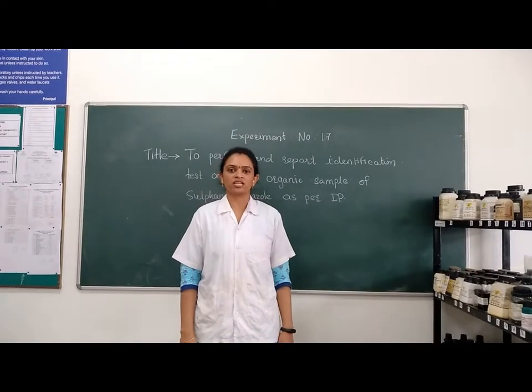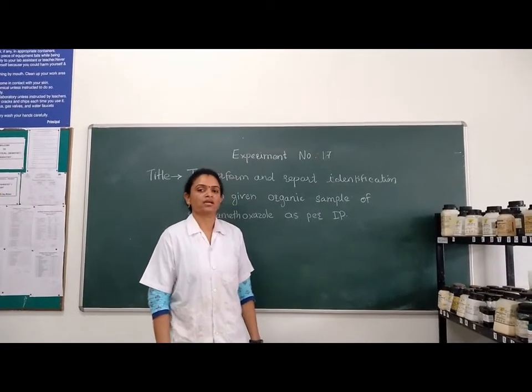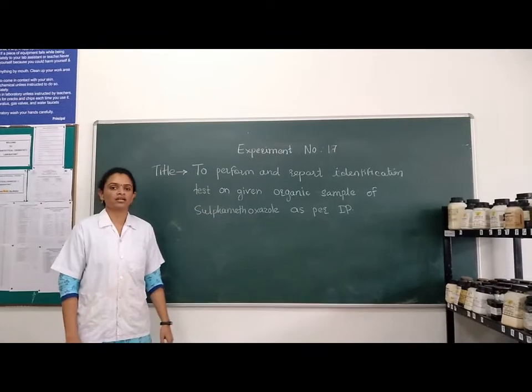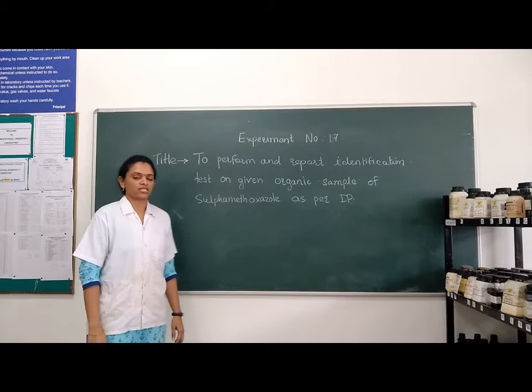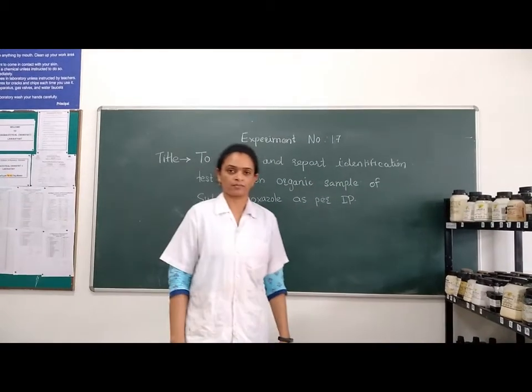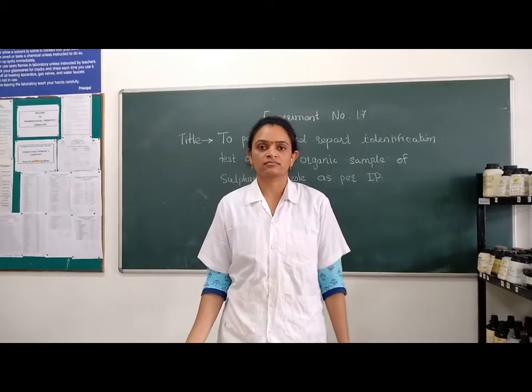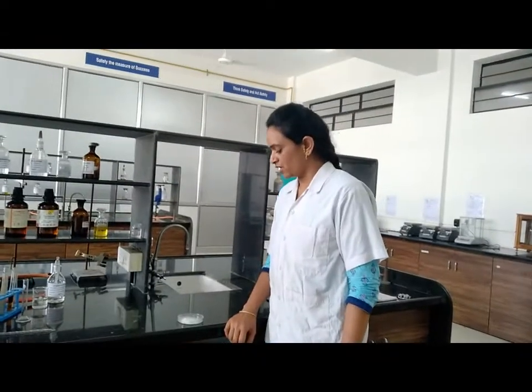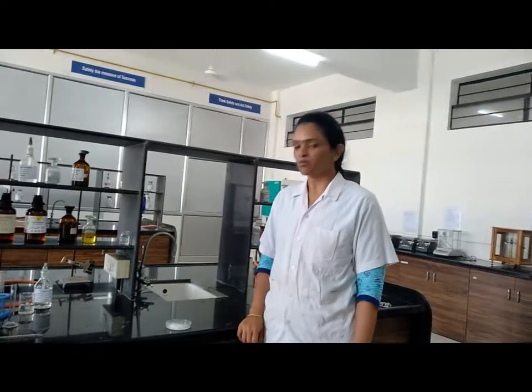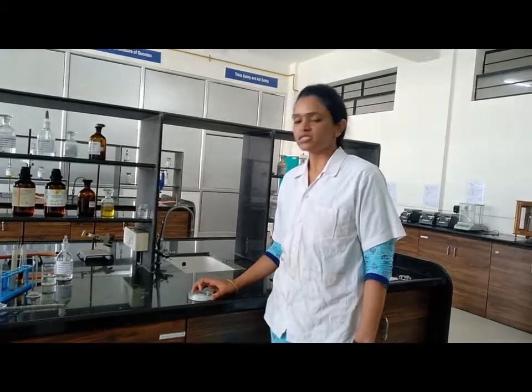Welcome dear friends in the pharmaceutical chemistry laboratory. Today we are going to perform identification tests on the given organic sample of Sulfamethoxazole as per IP. The first test is Description. Sulfamethoxazole is a white colored amorphous powder and it is odorless.